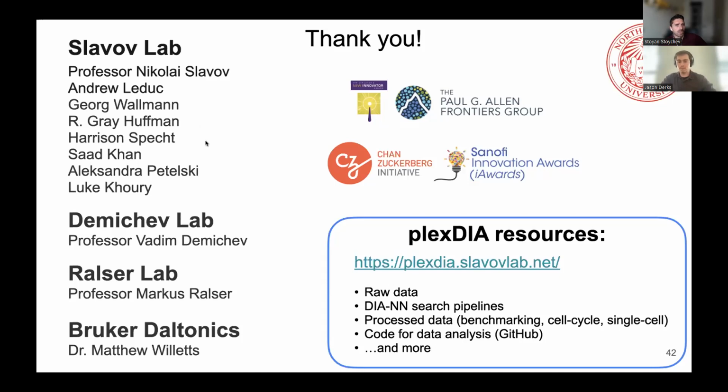Right. So I saw that you have the 2 acquisition schemes. You have the MS1 optimized versus MS2 optimized. So the MS1 optimized got more precursor ion scans versus more product ion scans for the MS2 optimized. What is your feeling in terms of which one should go for? What are the pros and cons of each approach?